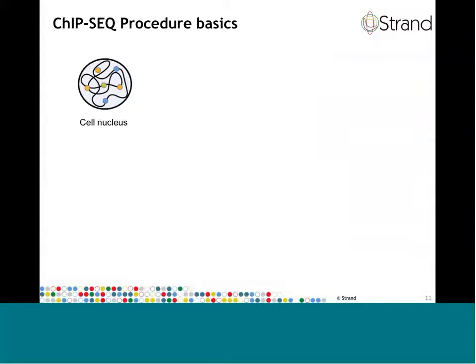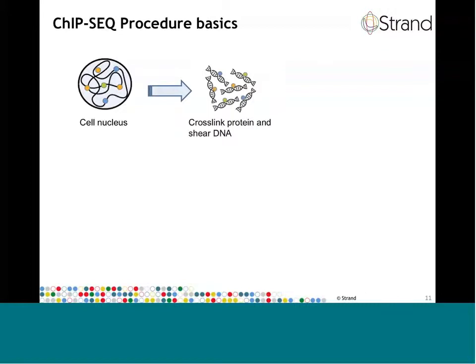So this slide explains the ChIP-Seq experimental procedure that precedes the data analysis in Avadis NGS. You normally start with a cell that is in a particular state, either a growth phase or disorder, for instance, and the cell is then treated with a chemical that results in the cross-linking of all DNA binding proteins, such as transcription factors and histones, etc. The DNA is then extracted from the nucleus and sheared to a particular fragment size.